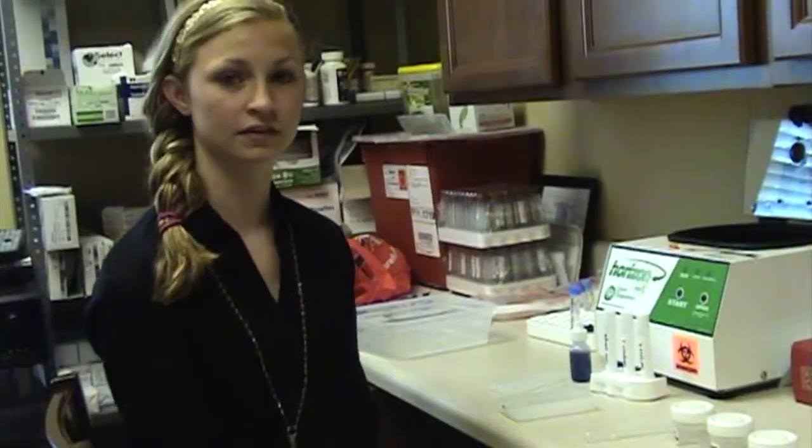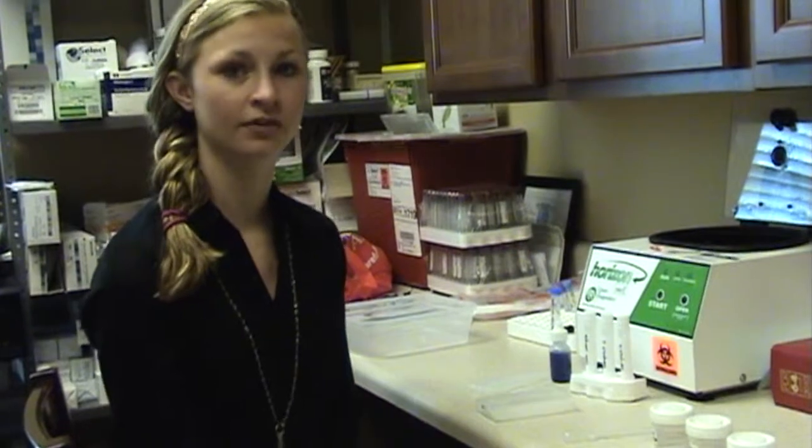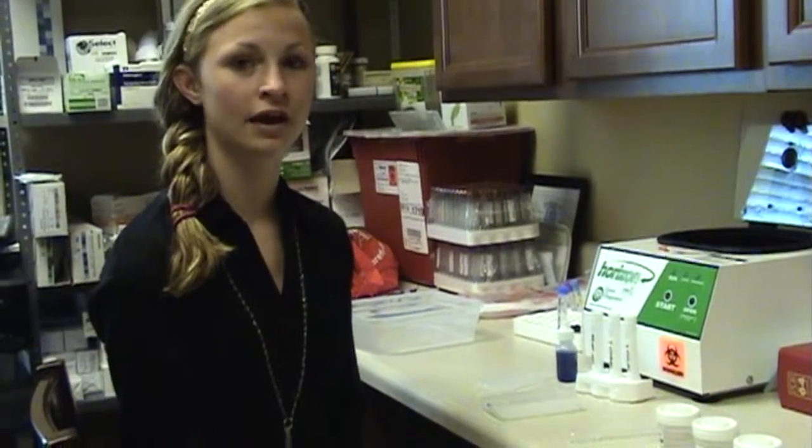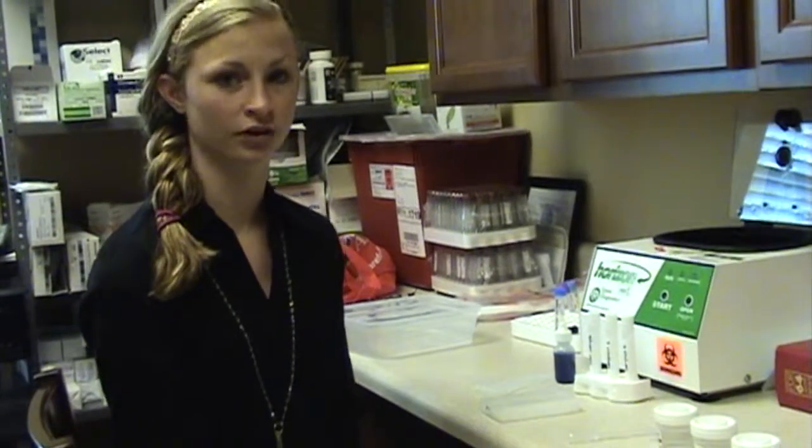After a few hours, the DNA has been successfully cut up by the restriction enzymes. I will now add blue dye to the solution so we can track the DNA movement through the agar gel.